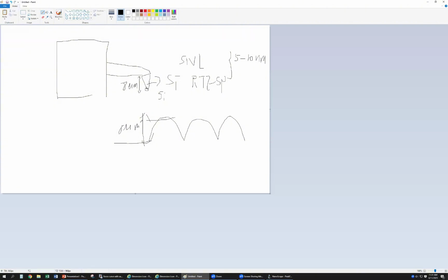That's why we have higher-value probes for cells. For cells, this is around 17 micron. So this probe is called the cell probe. This one is for cells.